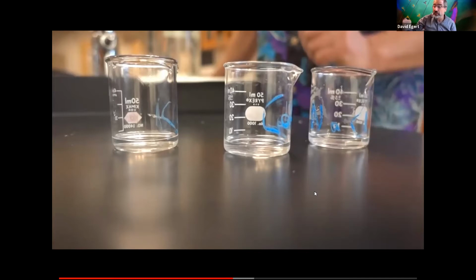And I should also just mention, I'll reiterate, there are gradations on the beakers to give you a ballpark of what the measurements are, but those are never accurate. You never trust those to be actual volumes beyond just a ballpark, so you know where you're close to.